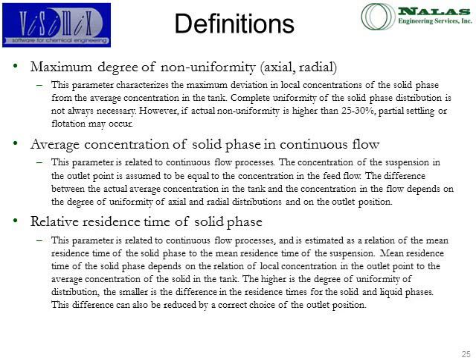The average concentration of solid phase in the continuous flow: if you had the solids suspended, ideally you would know what that ideal value would be. We wanted to see how close we were to ideality. And then the relative residence time of the solid phase is how long that particle stayed in your reactor. If it stays in too long, that might be one of the challenges you have with growing: is growth dominating, and getting that spherical material.